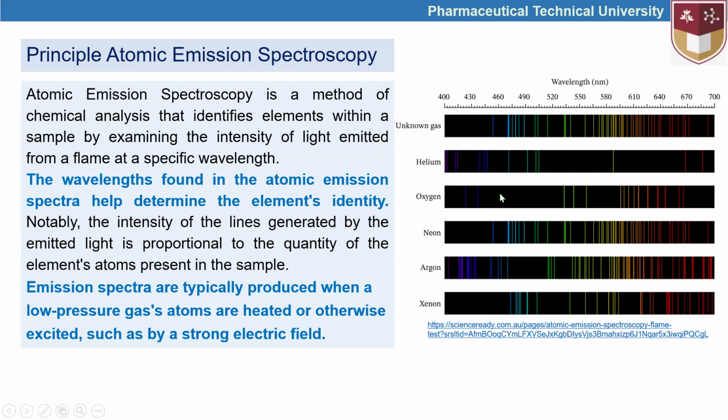So based on this kind of emission spectrum, we can exclude the presence of helium and argon, because here we do not see any kind of overlapping bands or corresponding bands. And oxygen can be categorized the same. Here we do not see something like that.